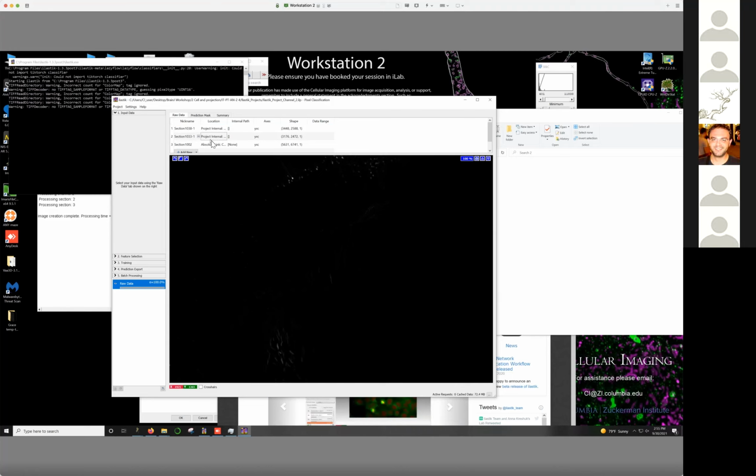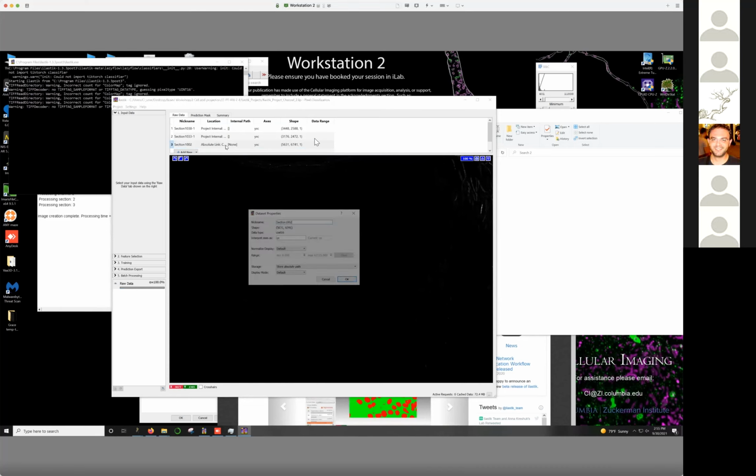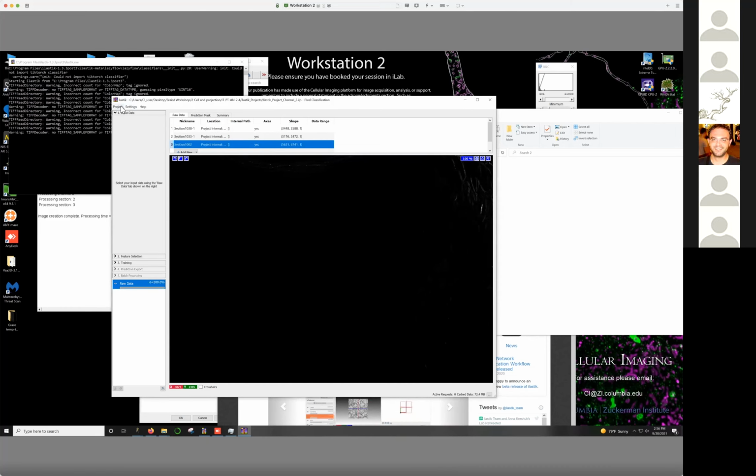So I'd recommend saving this image into the project, which you can do by clicking Edit Properties and changing the storage to Copy to Project File. If you do this, then you can save the project, and this image is now embedded in the project file. That means you can take this project anywhere, and it lets you validate how the training has been done. It lets you modify it or improve it without having any errors. So this is the first step.